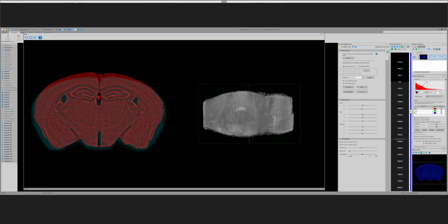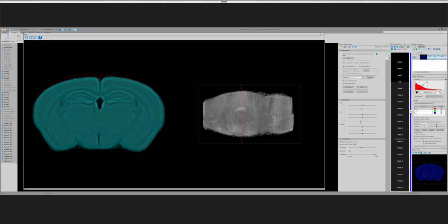Want to give it a little bit of a head start by getting to the right close. I get close by just getting close where the hippocampus is. And now if I run linear, hit the run linear function. Now the program itself is going through, and Brian, you might describe what the program's doing since you wrote this part.